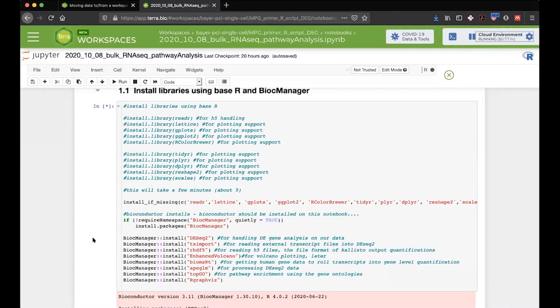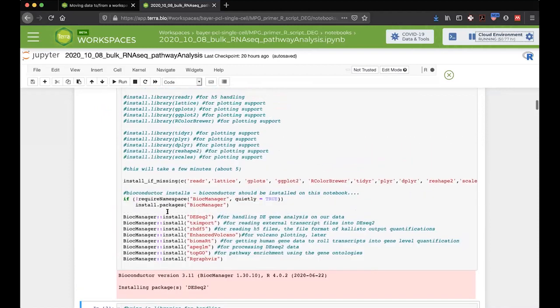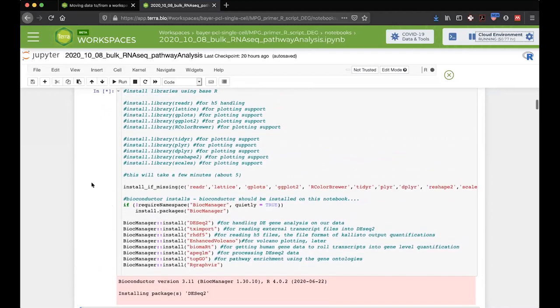Amelia, there was a question as to whether you generally install every time you run or if you use a Docker image. So what I typically do is, I actually cleared out my cloud environment last night so that I would be installing with you guys, and that would give me a better sense of pacing. But generally, I don't save off Docker images for this.